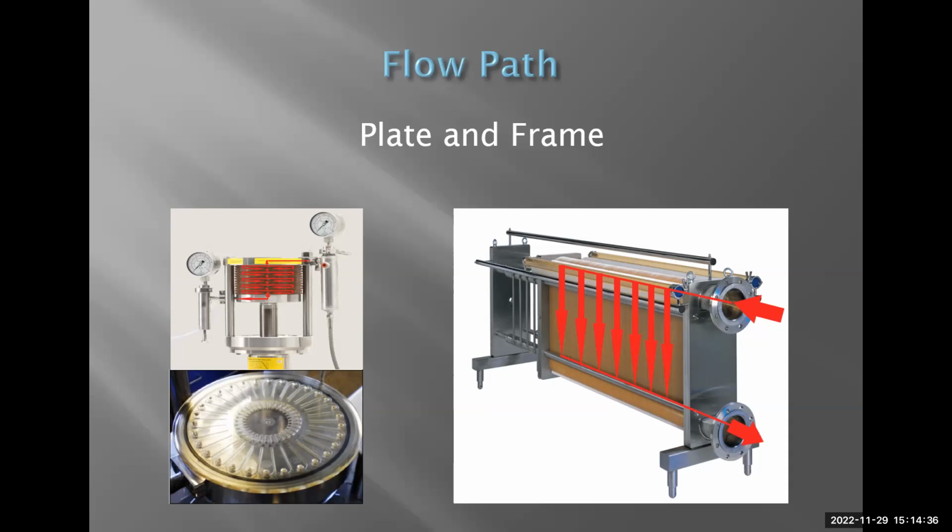And the reason is flow comes in through the top and hits a plate, which you can see in the bottom left side of the picture here. The flow then goes outwards on the plate to the holes on the peripheral where it hits the next membrane plate, and then the fluid goes in towards the center where it then hits another orifice, flows out to the next membrane, down towards the center of the next membrane. Because of this, there's a very high pressure drop across the membrane skid. And that's one of the reasons that we can't use this for direct scale up.